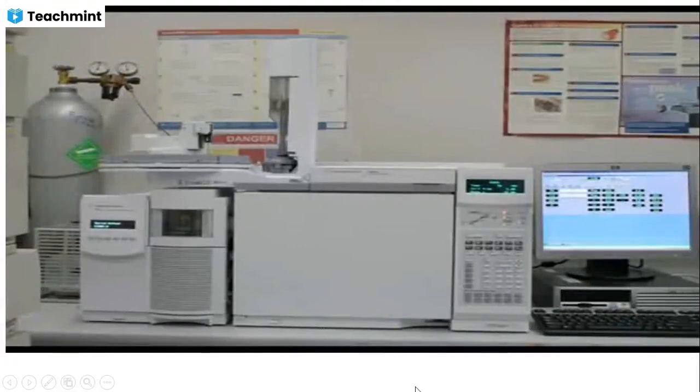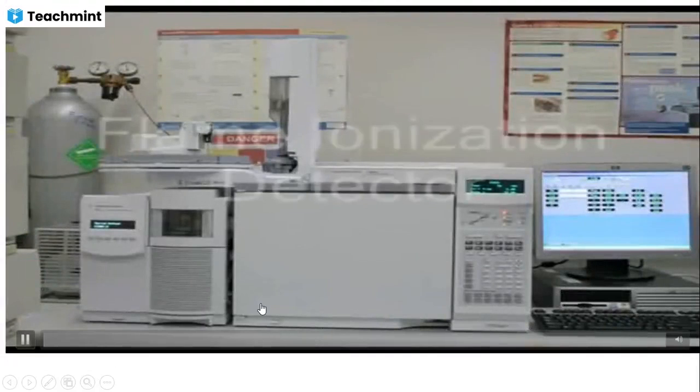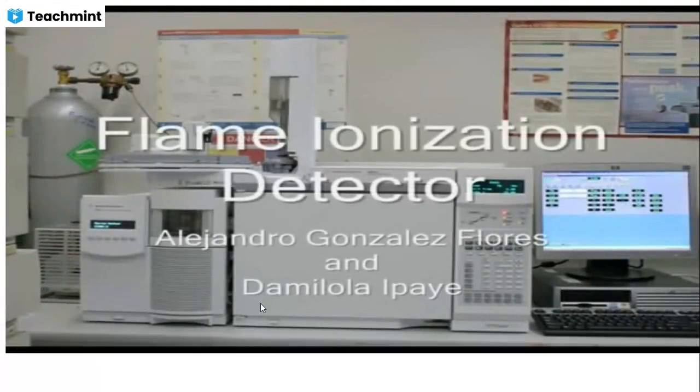Here generally once again I will show in detail. See that particular flame ionization detector.